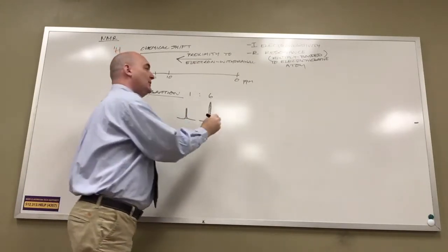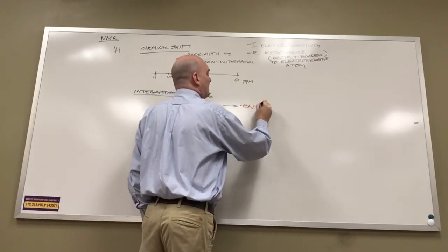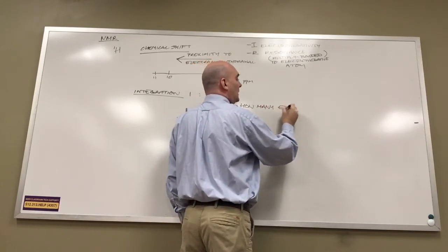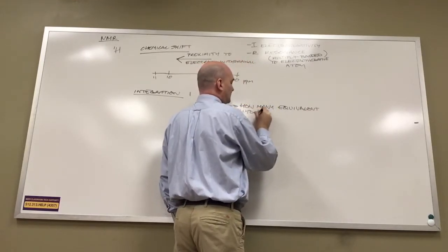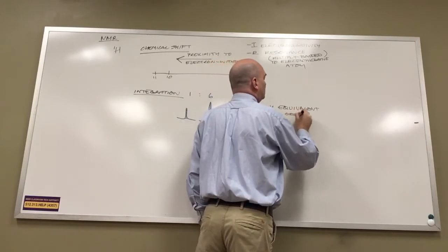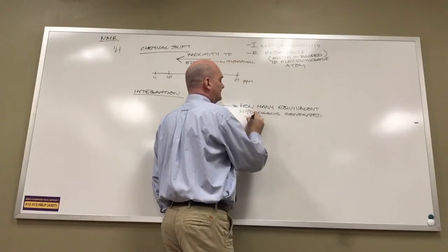The area underneath the curve tells me how many equivalent hydrogens generated the signal.